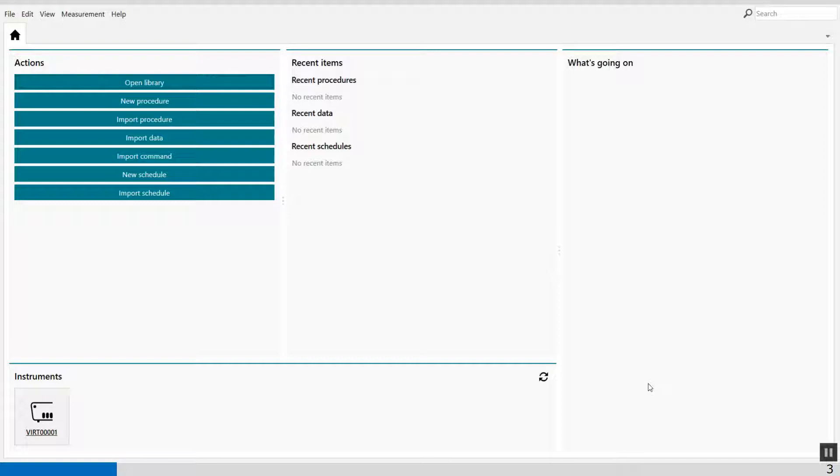This video shows how to merge two individual measurements into a single NOx file and do a baseline subtraction of the CV data. What I've done, I've copied demo number one and demo number 20 from the demo database to my data.